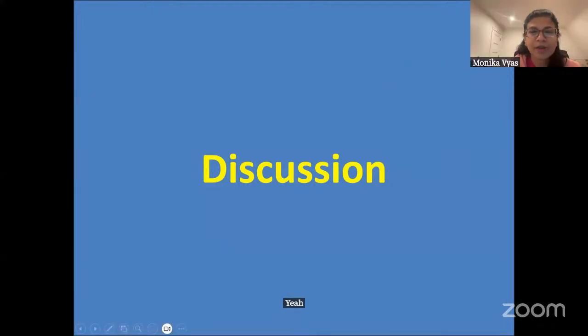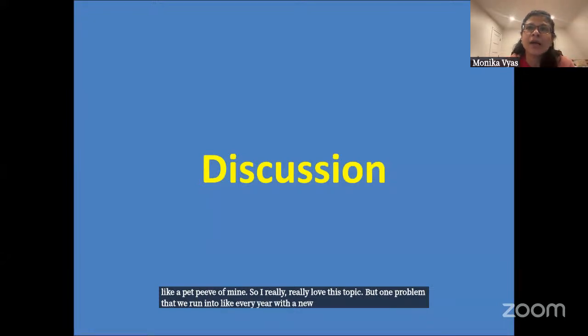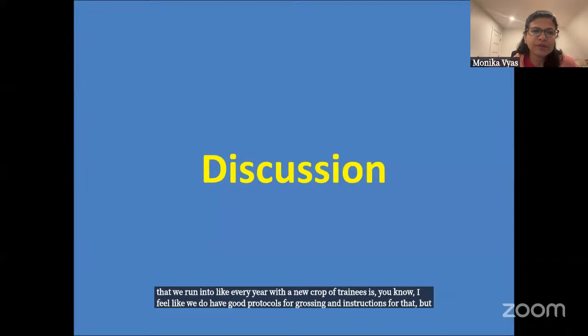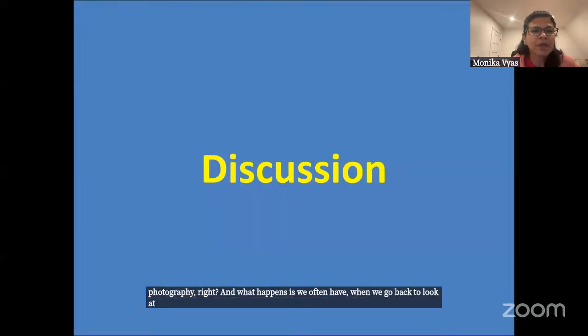Yeah, thank you. Again, all great points. Specimen photography is actually a pet peeve of mine, so I really love this topic. But one problem that we run into every year with a new crop of trainees is that we do have good protocols for grossing and instructions for that, but no instruction on specimen photography, right? What happens is that when we go back to look at gross images, we find pictures of intact organs and then no pictures of slices. So those intact pictures are basically useless for me.